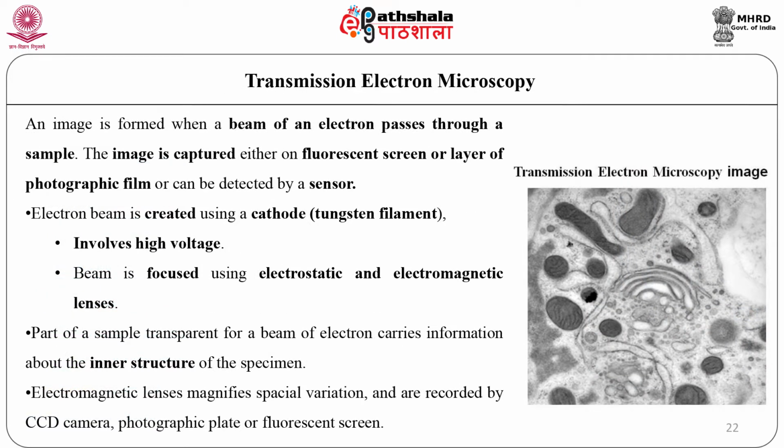The scanning electron microscope scans a fine beam of electrons onto a specimen and collects the electrons scattered by the surface. This has poorer resolution, but it gives excellent 3D images of surfaces. In a scanning electron microscope, at the top of the instrument, an electron gun is placed to produce a beam of electrons. The vertical path through which the electron beam is passed is filled with a vacuum. It travels through electromagnetic fields and lenses, followed by the sample.